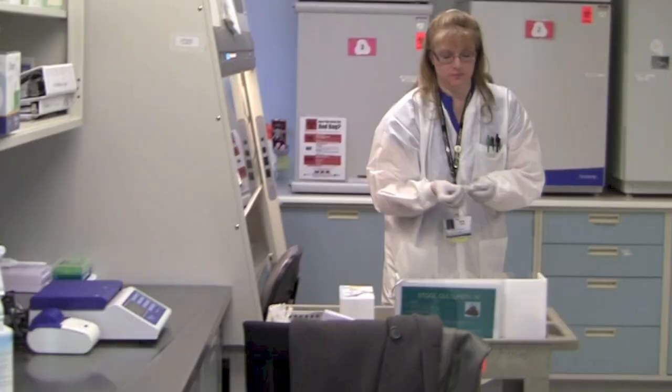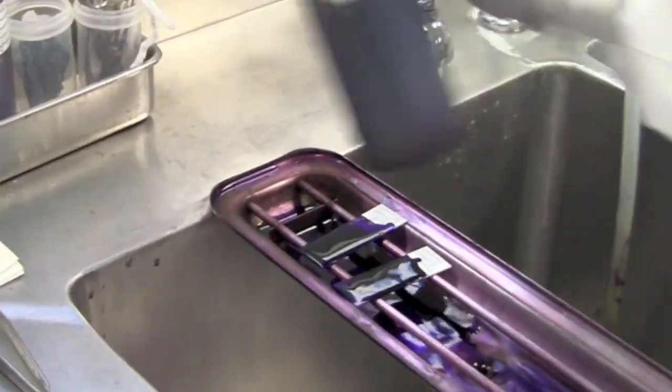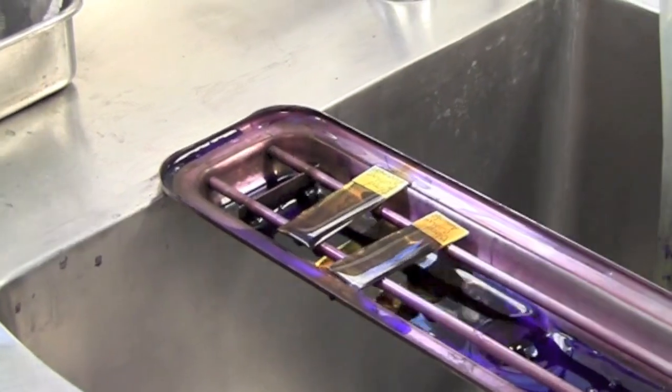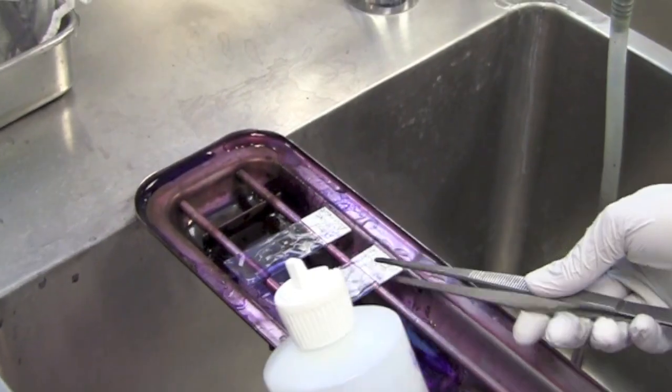The slides which have been set aside are now brought over to a sink for further processing. The slides are stained and fixed with special chemicals followed by rinses. This process is used to gram stain any organisms present for rough classification of the infectious organism.